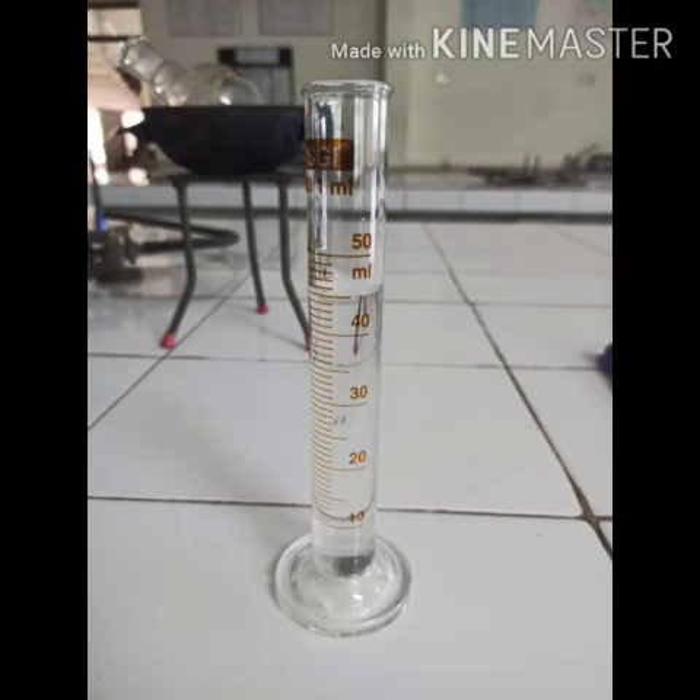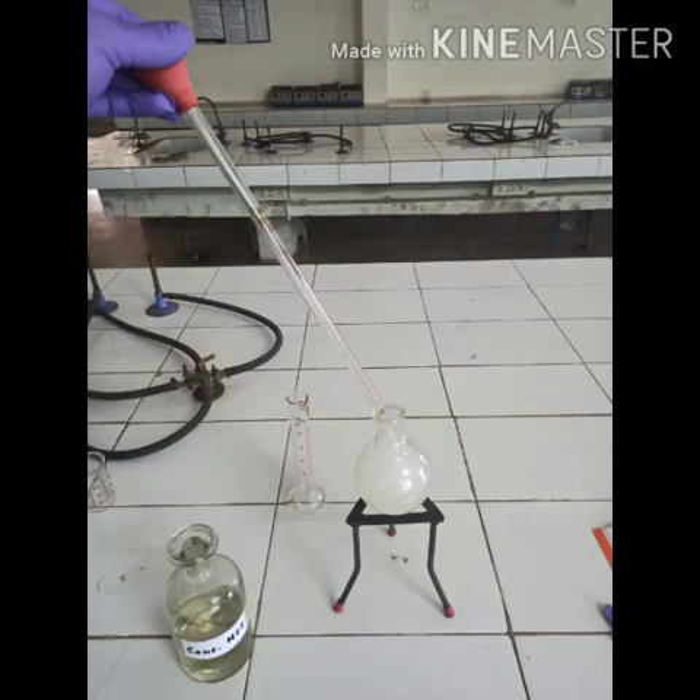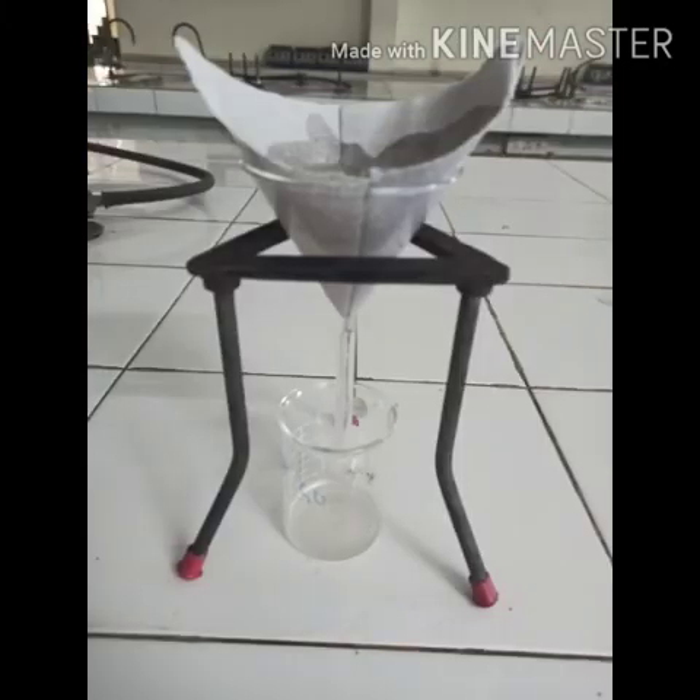45 ml of hot water was added to the reaction mixture, followed by concentrated hydrochloric acid with constant stirring until the solution is acidic. The concentrated HCl needs to be added until the solution turns acidic.